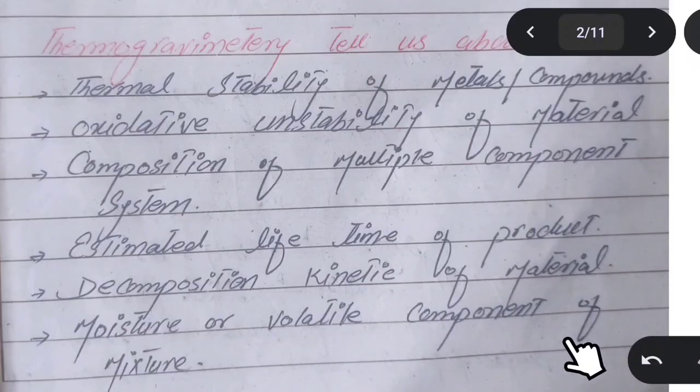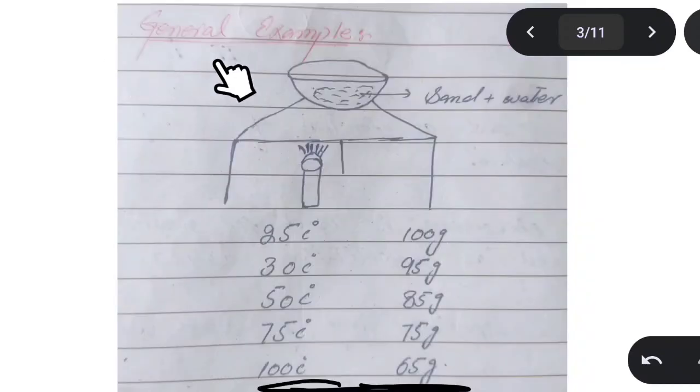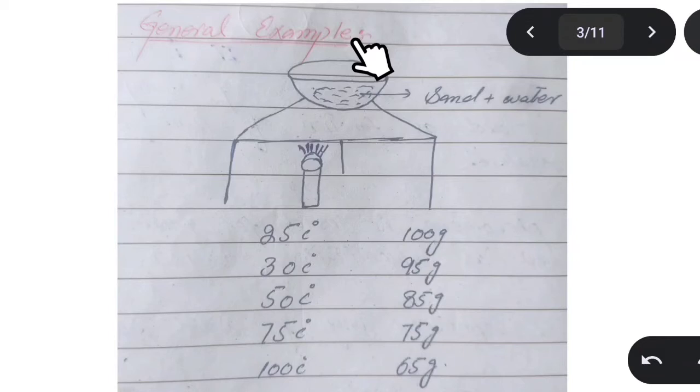The moisture or volatile component of the mixture. By using thermogravimetric analysis we may determine whether water of crystallization is present in the compound or not, or any moisture or volatile component like NH3. Sometimes, in the case of CoCl3, cobalt trichloride, ammonia is present and it is released in the gaseous phase. So this is the general example of the representation. I just assumed or supposed these values to deliver the concept regarding thermogravimetric analysis.